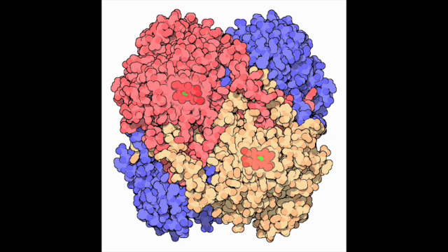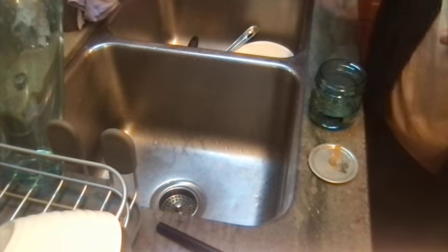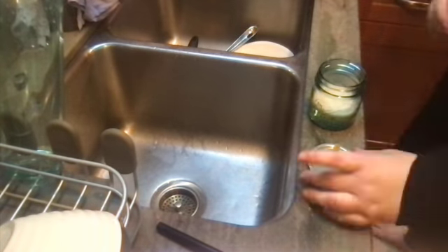Sarah Miller here. So this week we'll be looking at an enzyme called catalase, what it does, how it does it, and where we can find more of it. The experiment we'll be carrying out will be using catalase from yeast to produce lots of oxygen to fuel our noodle rocket, which we'll see near the end of our video. First, let's look at the reaction.